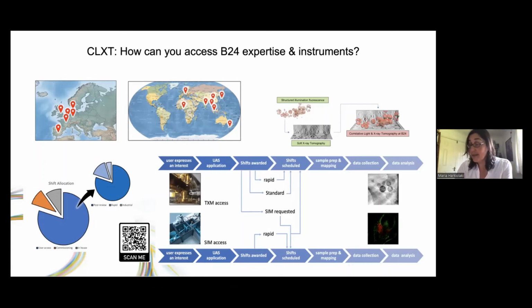We were looking at brain tissue, and in some areas, because the cutting wasn't straight, we could get some information. But the problem with tissue is also localization. You need to find some way of fluorescently tagging what you want to see, because a lot of the material is going to be dense.